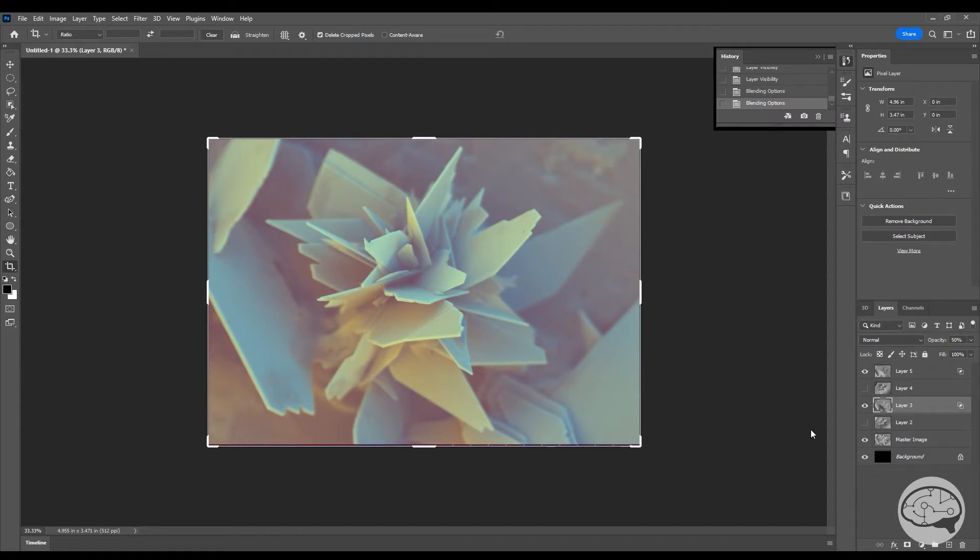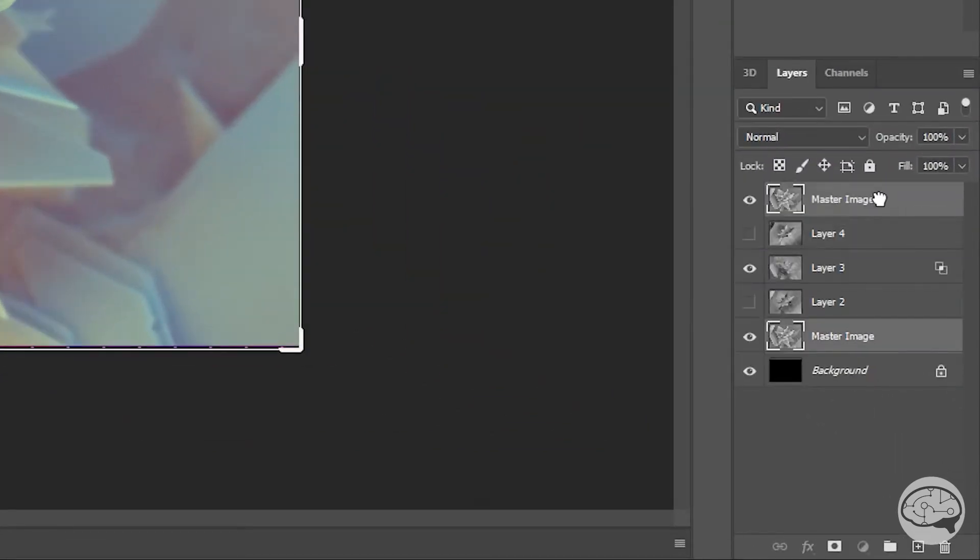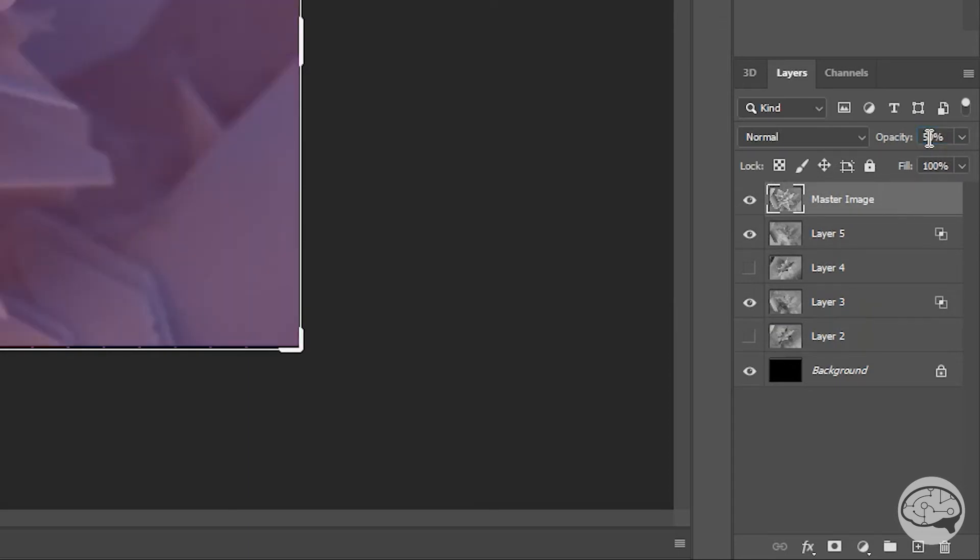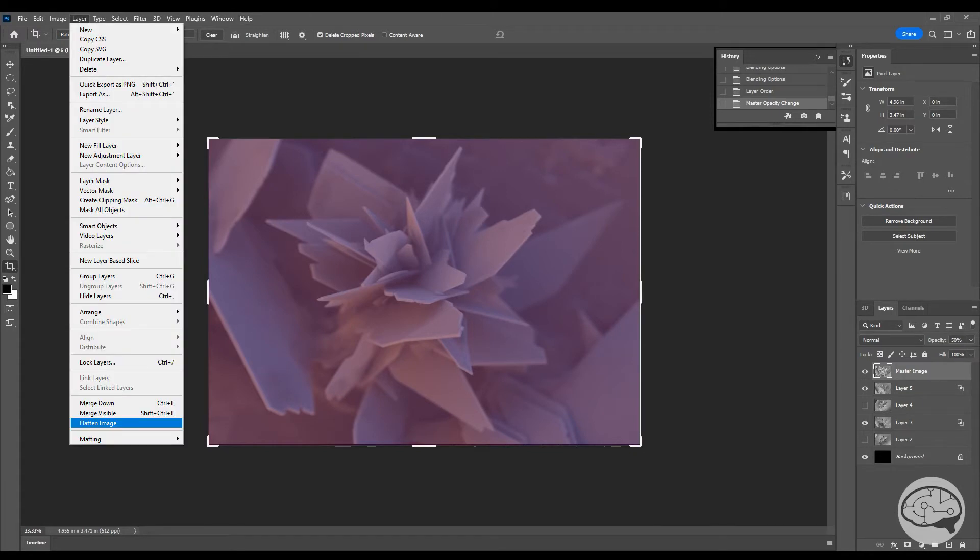So now we've got this image with some very strong colors on it. In some cases, we can maybe leave it this way, but I think it's best to continue on and make some more adjustments. The main adjustment we can make is to put our master image on top of these other image layers and then set its opacity to 50%. Again, we can change that later if we want. Usually once that's done, our colors will go all weird and purple, and that's okay.